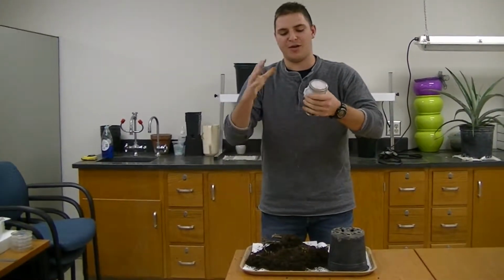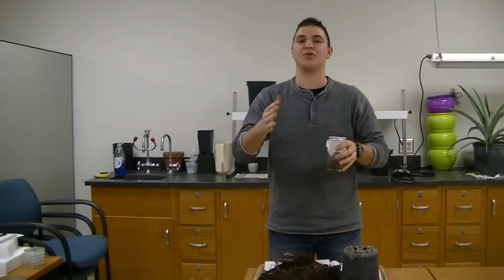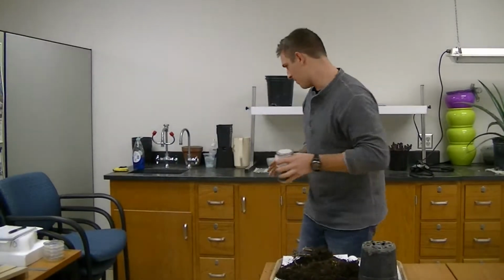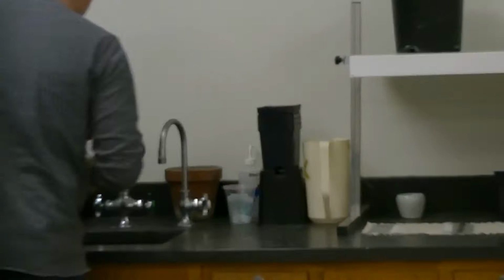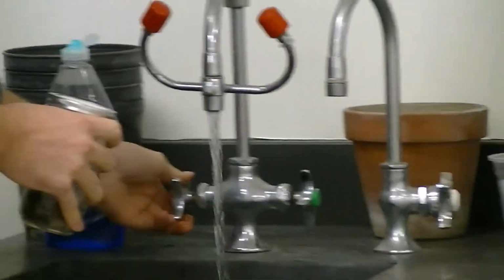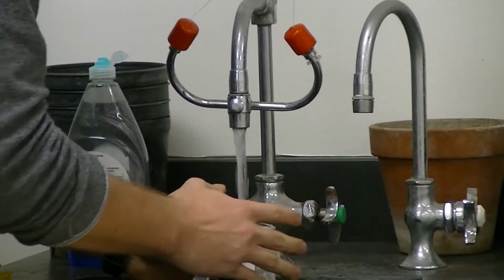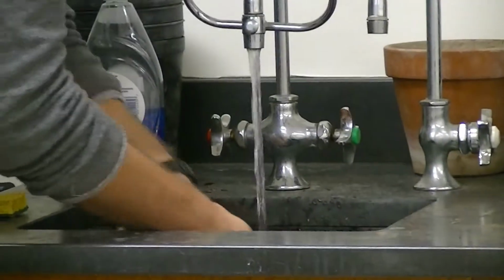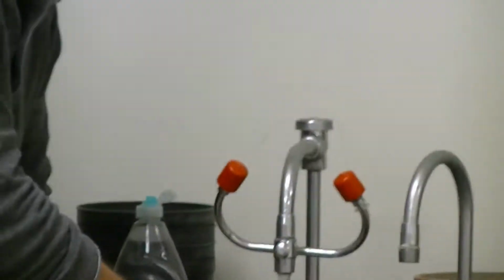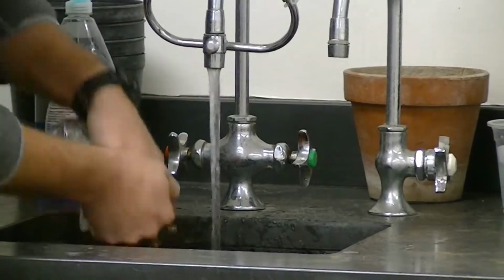So once you have your root tissue in your mason jar and you've capped it off, you have to rinse it. Now you can use sterile water, distilled water, or you can just use tap water. It doesn't really matter. For our sake, we're going to use some nice warm tap water. And the cleaning process is just as simple as filling the jar, shaking around the roots a little bit and letting it drain out, and beginning the wash process again. You'll repeat this until the root tissue you have to work with is nice and clean.